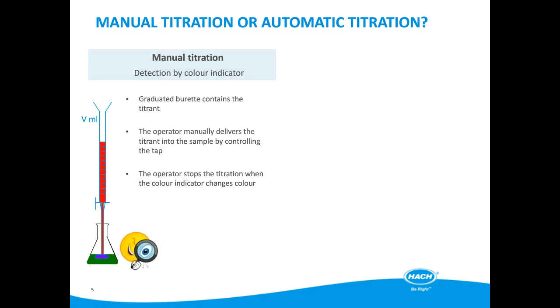At this moment, the user will note the titrant volume, calculate the concentration manually, and store the data. So this whole procedure is completely manual.